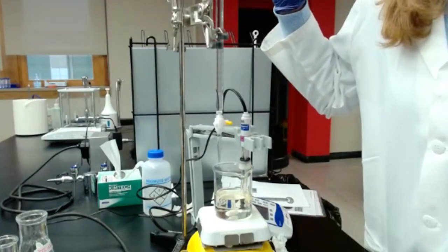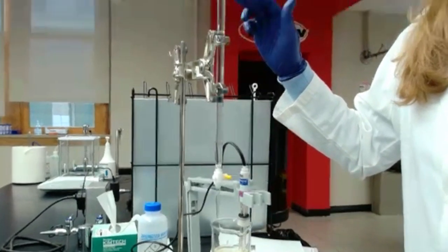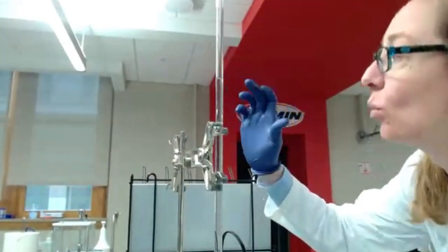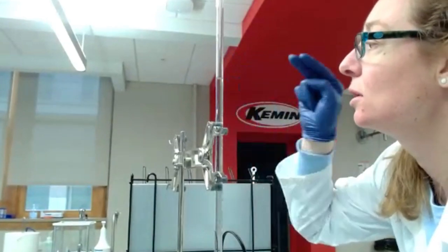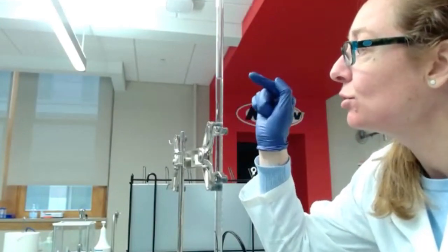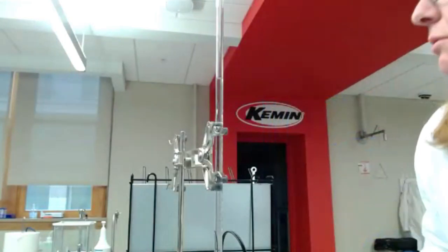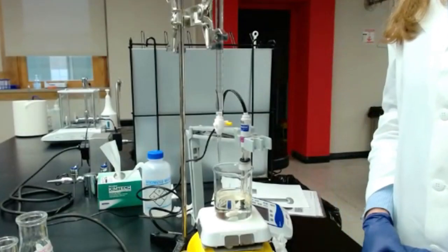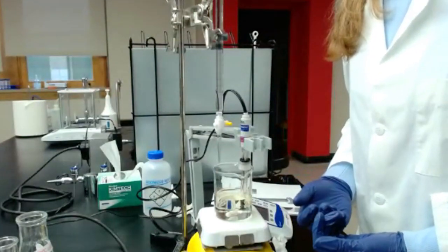Once I reach the correct pH, I will record the final volume. I go back to my burette and check once again the volume of sodium hydroxide in the burette. Look again at the meniscus and record that value, which is the final volume. So I've got 25.2. If at some point you go over the pH of 8.2, you will have to redo the experiment.